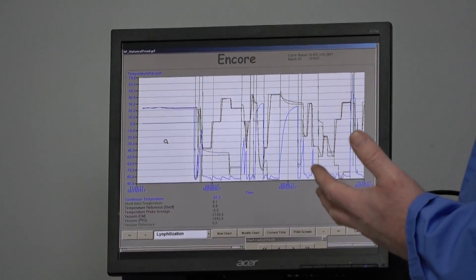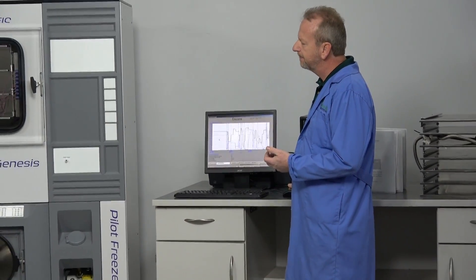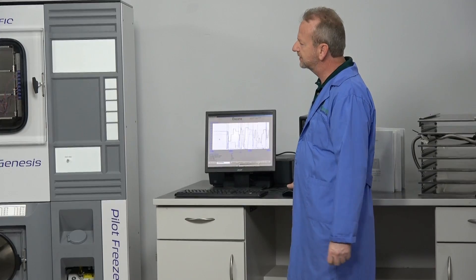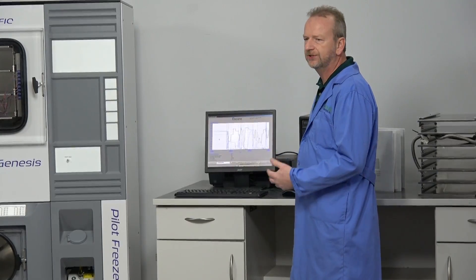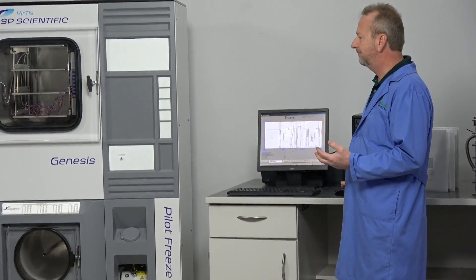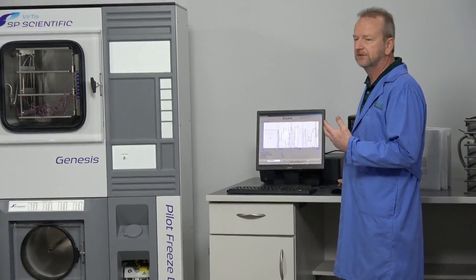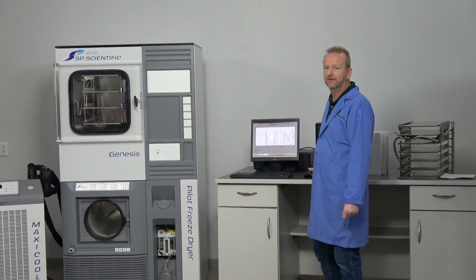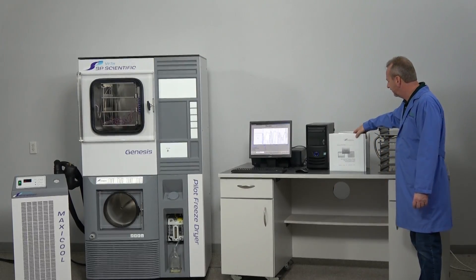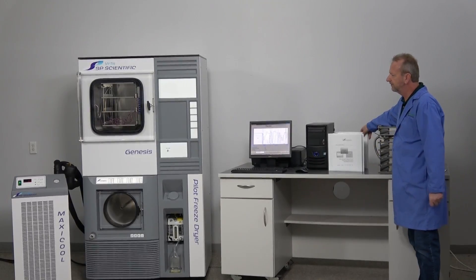Looking at it, it is barely broken in — probably only two recipe runs. It still has that new smell, the rubber seal is in excellent condition, all the hosing and insulation on the back is pristine. I've never seen a machine with this low of hours. We also have the Encore user manual and the Maxi Cool series user manual for the chiller.